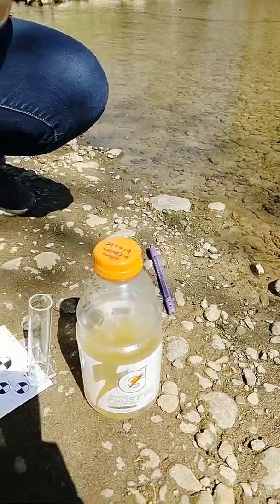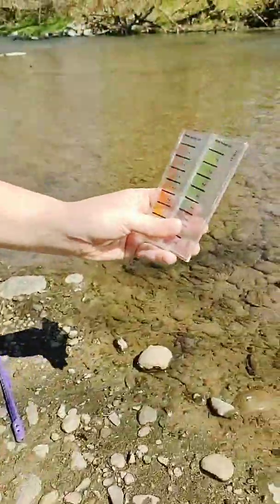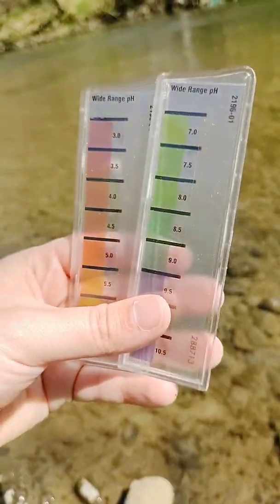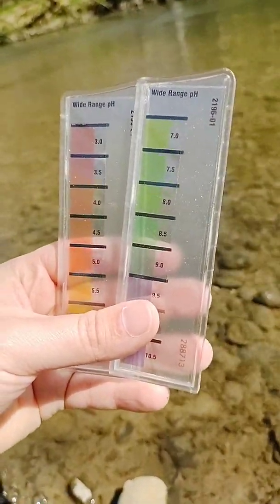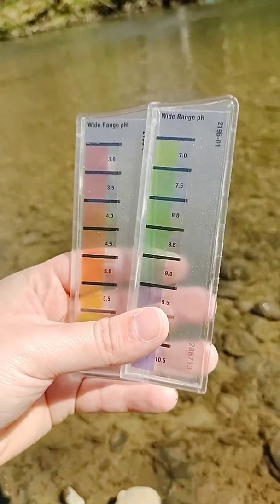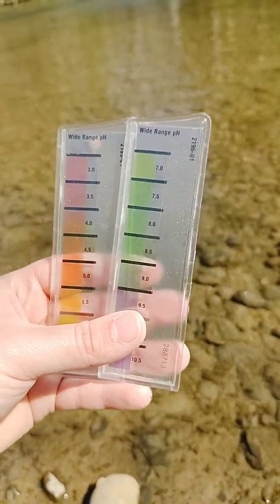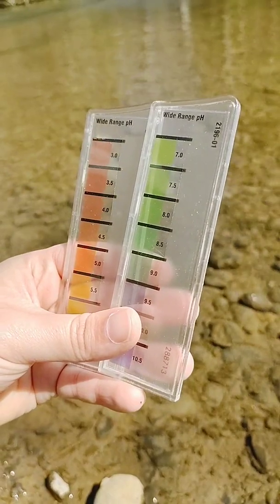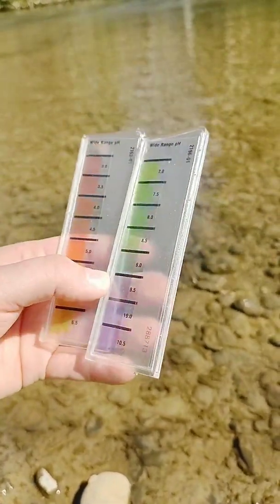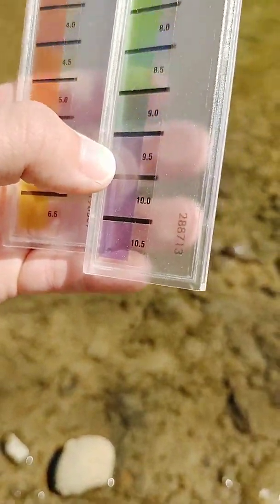We're going to go on to the next test, which is pH. Here are our indicator slides we'll be using. A pH value shows the intensity of acid or alkaline conditions. In general, acidity is a measure of a substance's ability to neutralize bases, and alkalinity is a measure of a substance's ability to neutralize acids. To get an idea of what these numbers mean, I'll give you some examples. Battery acid is considered a 1, which is extremely acidic. It's not even on our wide range slides here.